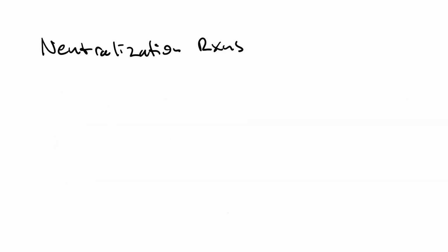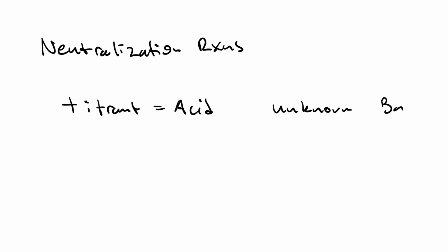Neutralization reactions lend themselves particularly well to analysis by titration. If your titrant is an acid, then your unknown is the base. On the other hand, if your titrant is the base, then your unknown is the acid.